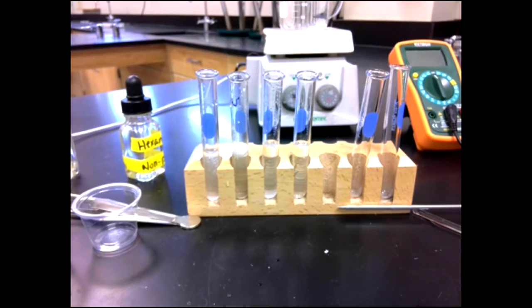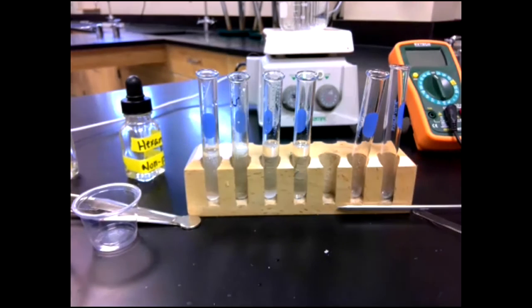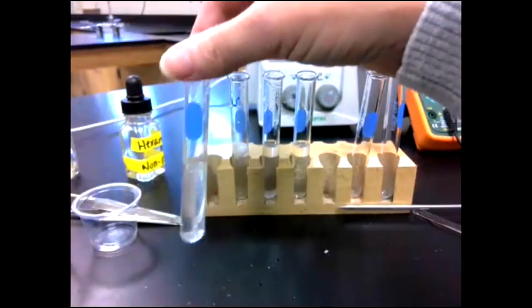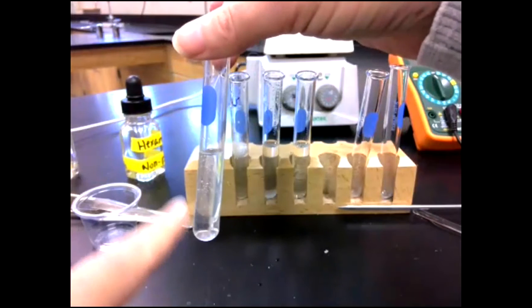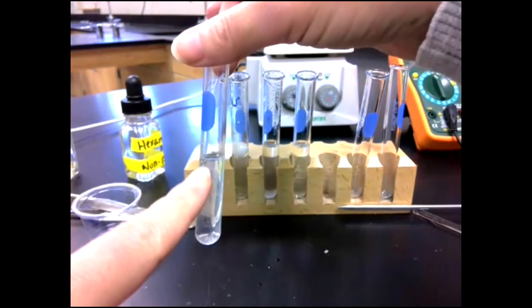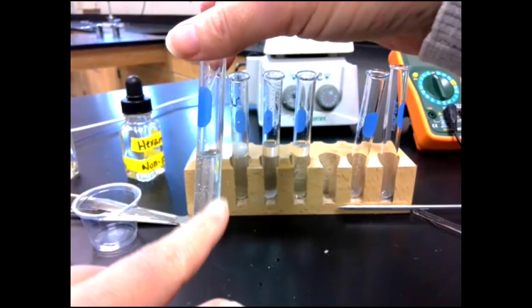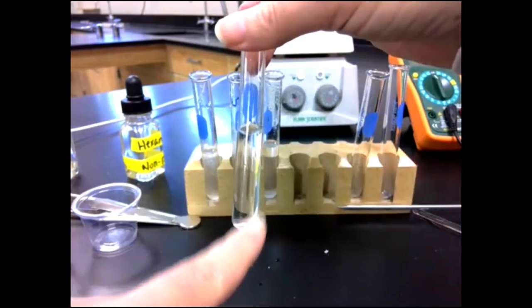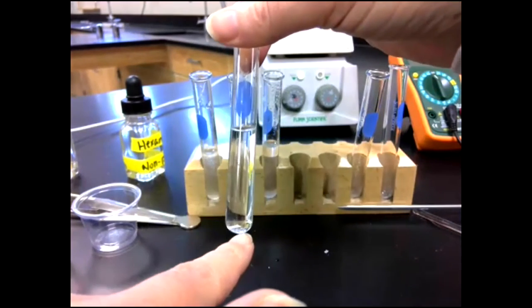The next thing we're going to do is look at conductivity, and solids don't conduct unless they're metal. So I'm not going to try to measure the conductivity of the solids because it's always going to be a no because they're not metallic. But what we are going to do is for the solution of A in water, because a solution is something that's dissolved. So we're only going to test the conductivity of solutions. So A makes a solution in water, we're going to test that one. And then B makes a solution in hexane, we're going to test this one, okay?